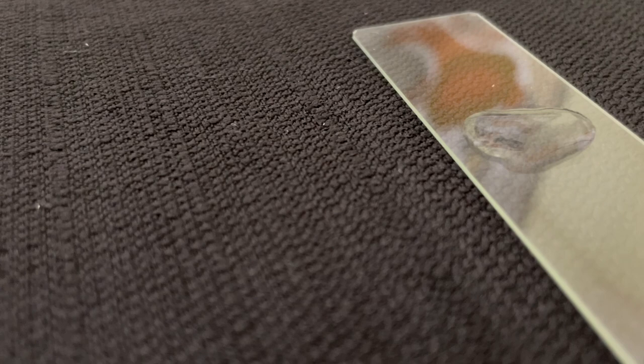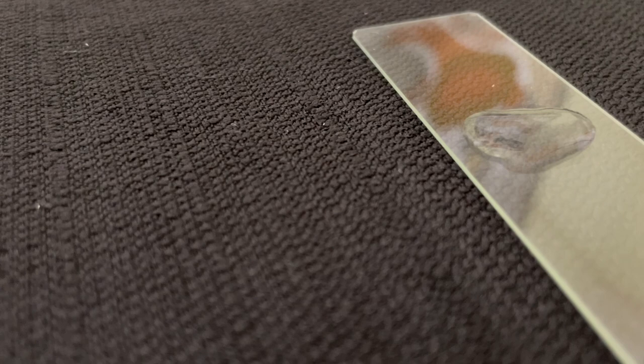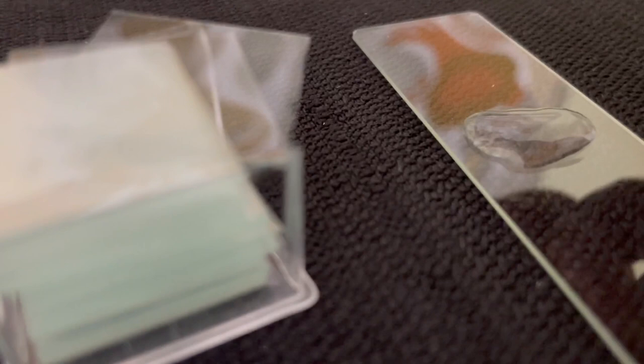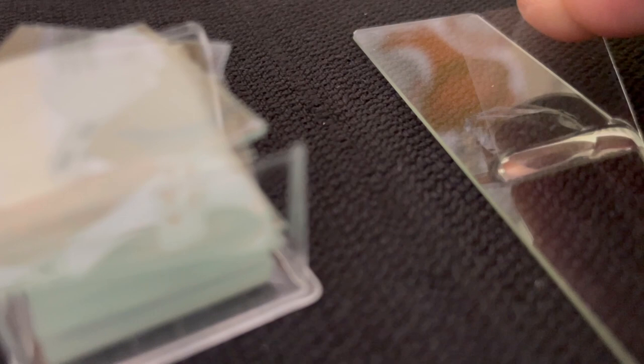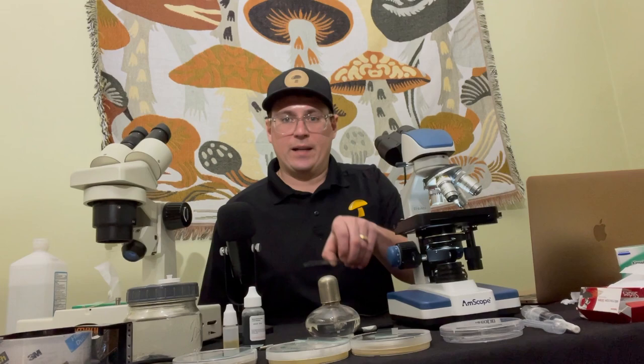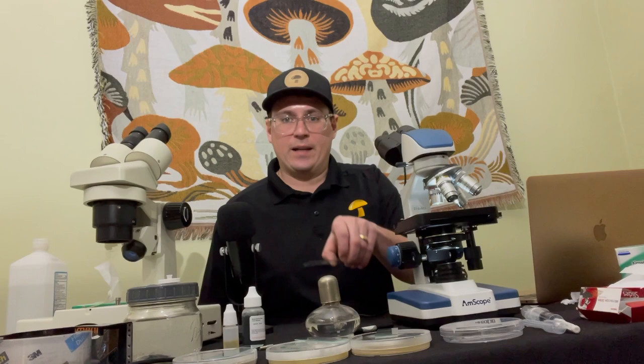Then I'm going to use this cover slip. Carefully, at an angle, you want to place just one slip — you're going to place one edge down so it spreads out, and then let that side drop down so you don't get any air pockets. So I have my lion's mane spores loaded up on my glass slide and the cover slip is on there, so I'm going to go ahead and place it on the scope.